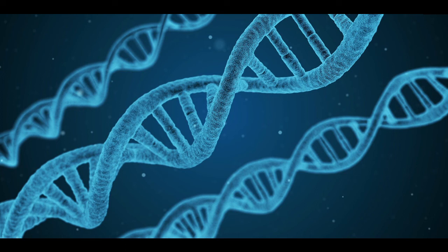Sigrid, do you want to talk about what everything can go wrong? Oh, sure. There are so many things. Somebody was texting me their gel yesterday because I lend out the lab to club members, and sometimes things go wrong. She texted me a gel and it was completely blank. It turned out that she had used two forward primers and no reverse primer for the amplification, but it could have been other things.